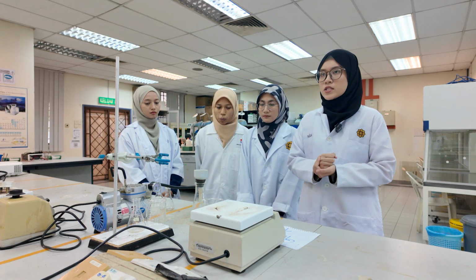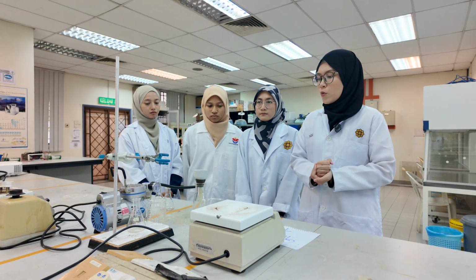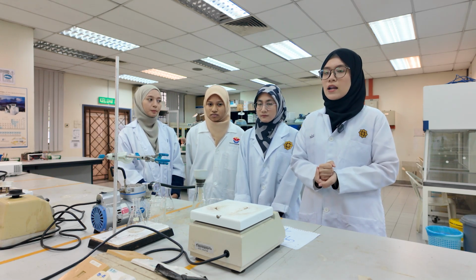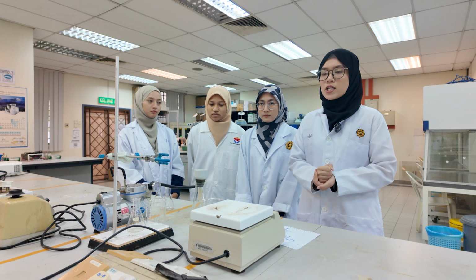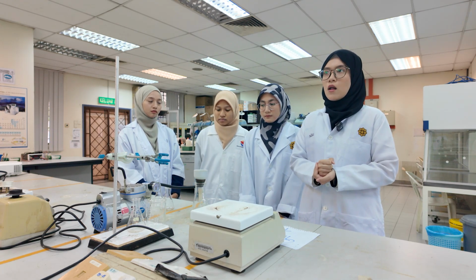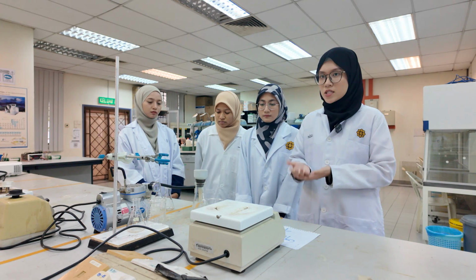Generally, we have to choose a solvent which is highly soluble at high temperature and poorly soluble at low temperature, which is water.